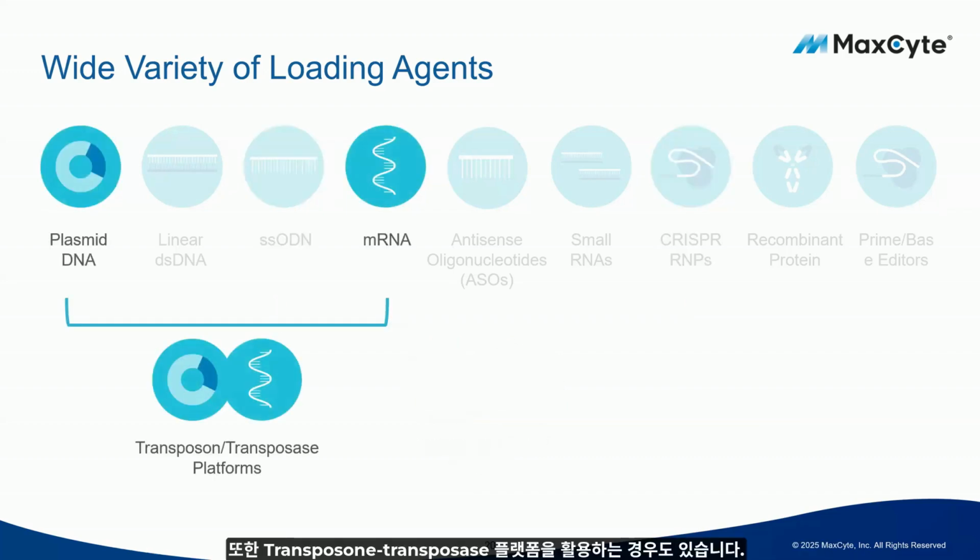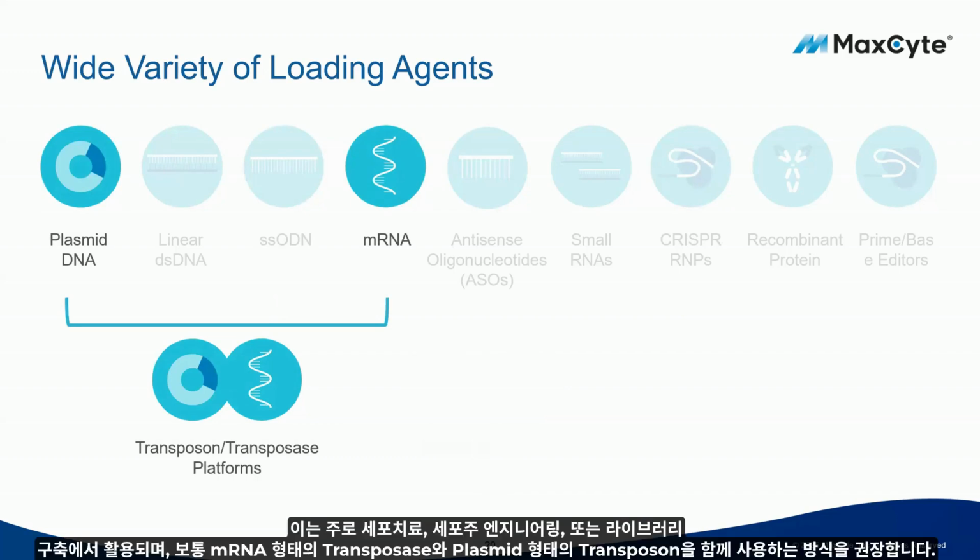We also have people doing transposase platforms, often for either cell therapy, cell line engineering, or libraries. And so we often recommend the mRNA transposase with the plasmid DNA transposon for that.